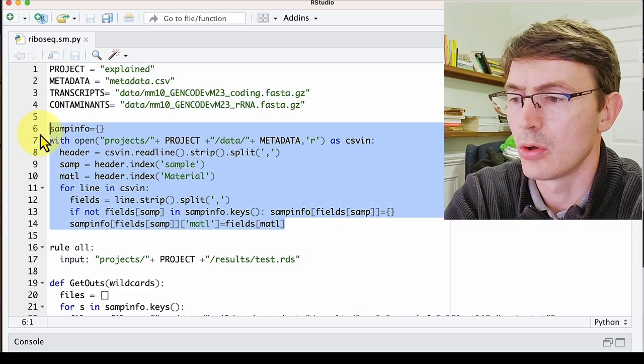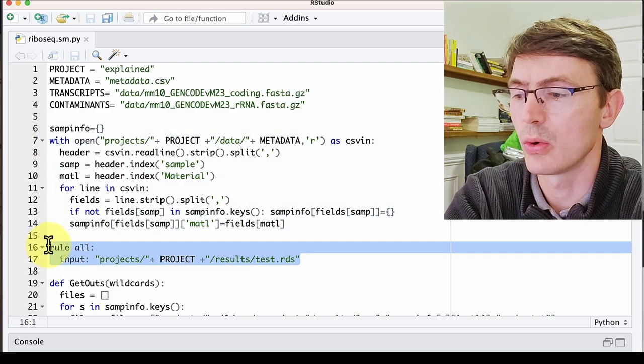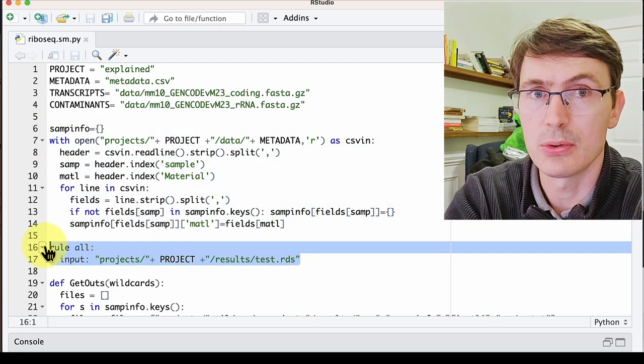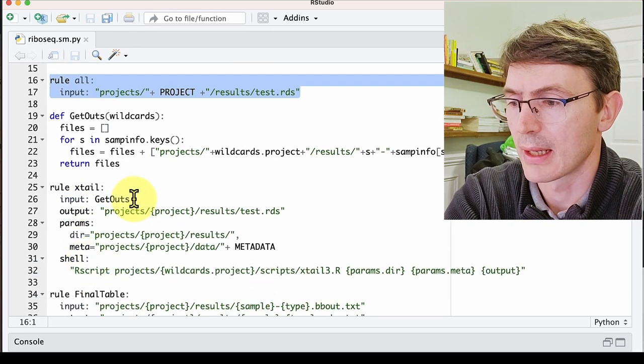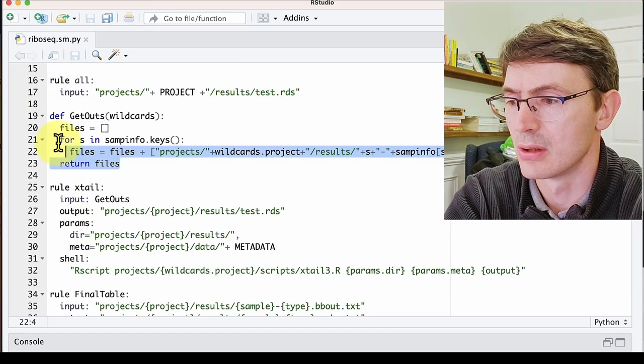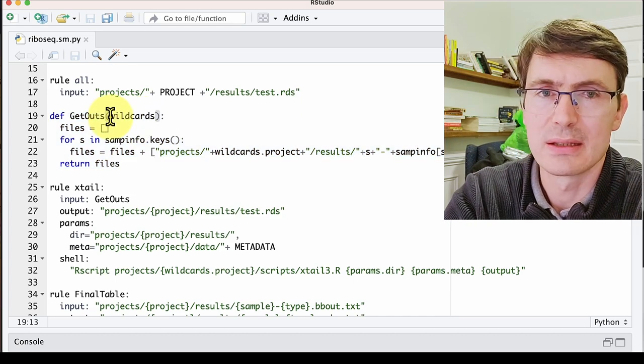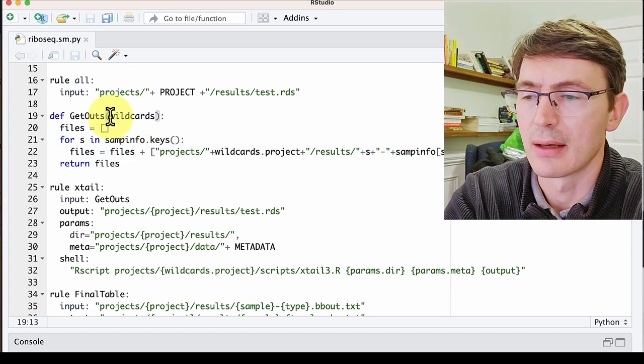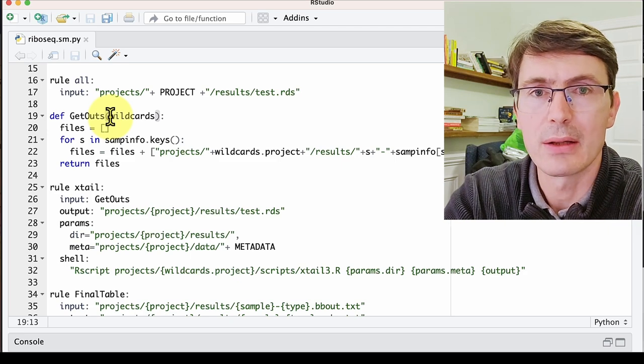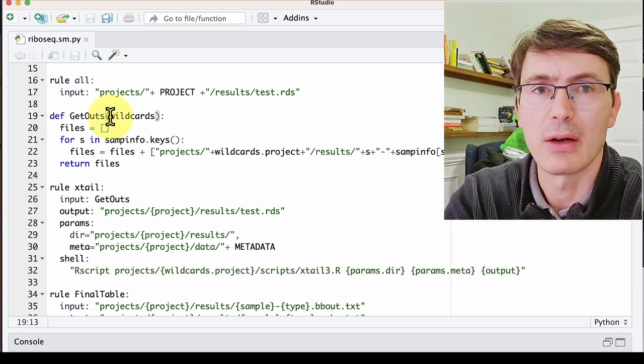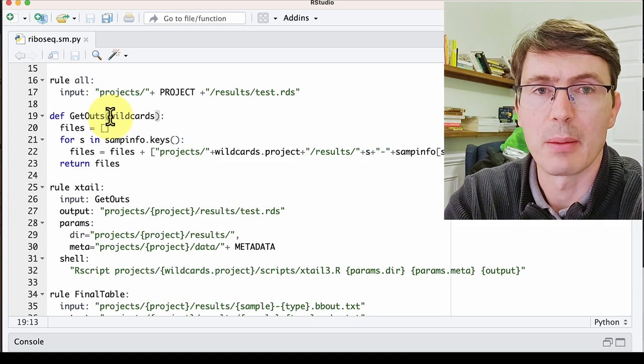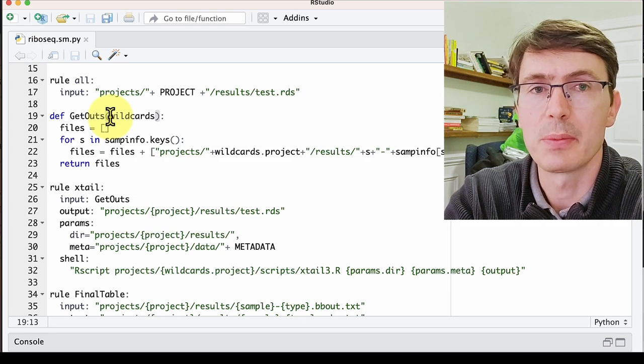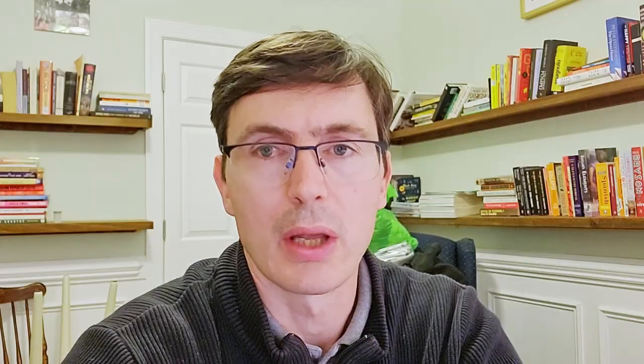We have this for loop and creation of a dictionary that's not very clear. Then we have this rule all that only has an input, and then we have this rule that has as an input this function and has these wildcards as parameters. So this is difficult to track and is not as straightforward. By the end of the video you will have a clear idea of what all of these things are doing, and you will be in a better position to use this script, to debug it eventually, and to expand it as you wish.